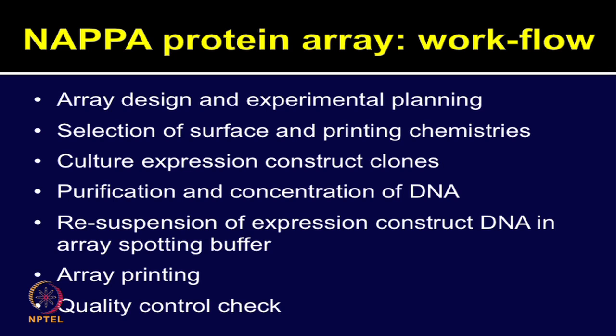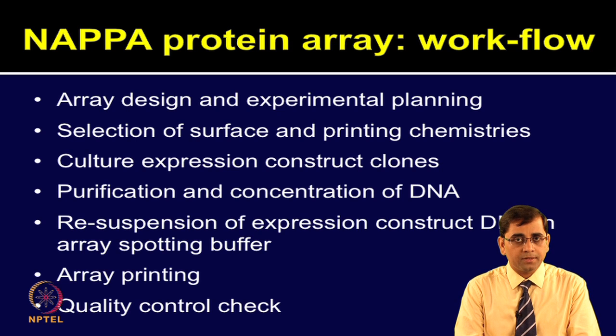If you have a specific objective in mind, for example, you want to study protein-protein interactions, you need to have some good positive controls for the protein interactors as well as some negative controls to rule out false positives.